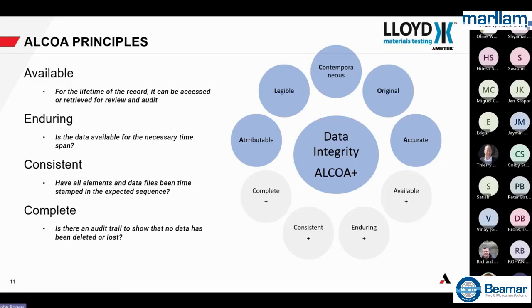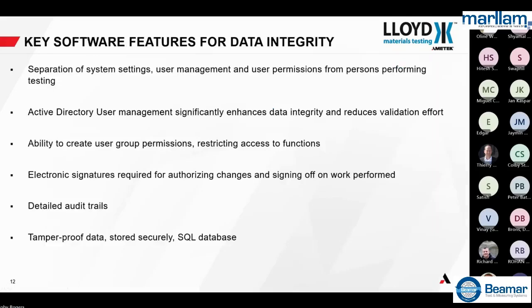So those are the data integrity principles that will just give some background onto some of the features that we have and why they're there. There are some key features that we would look for in a software for data integrity. The first one is to separate the administration of the system settings, the user management and permissions from those who actually perform the tests.